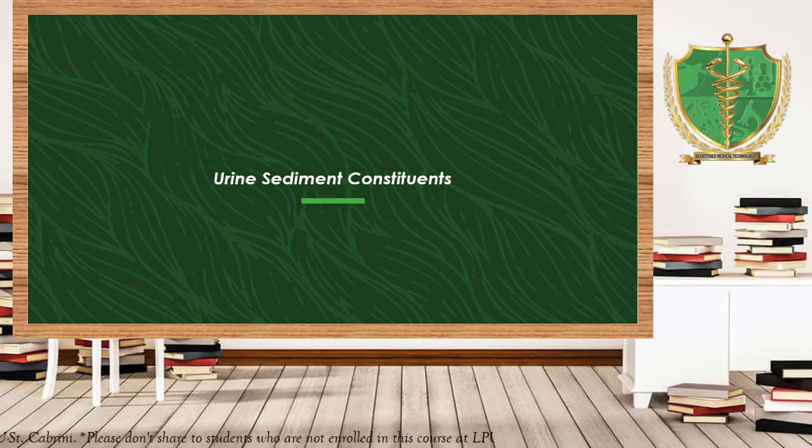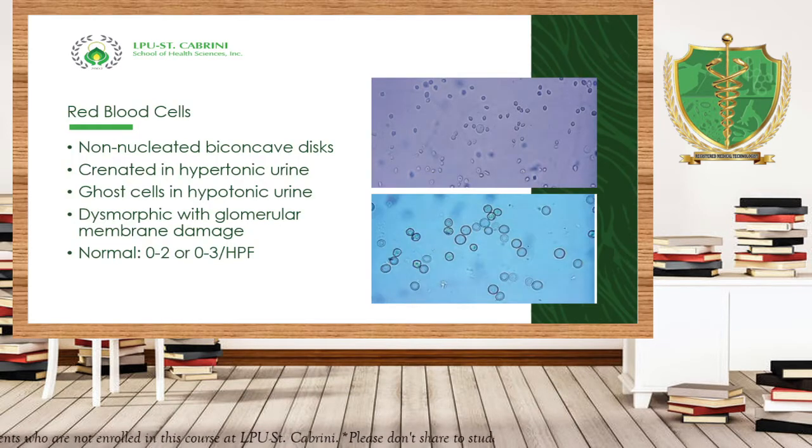Welcome to the second part of our discussion about microscopic examination of urine. Okay, so the first sediment constituents that we are going to discuss is the red blood cells.